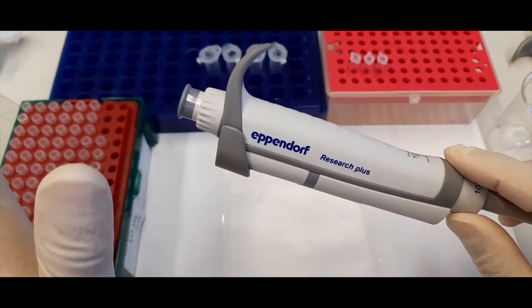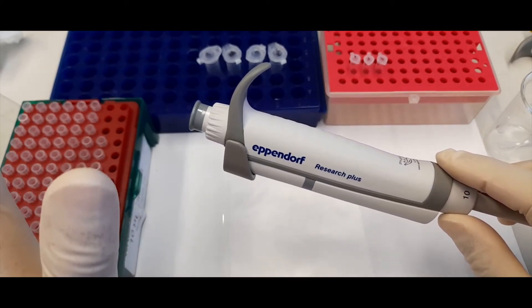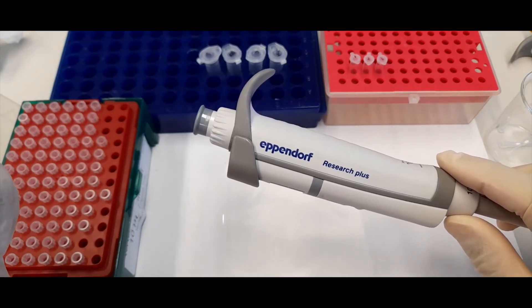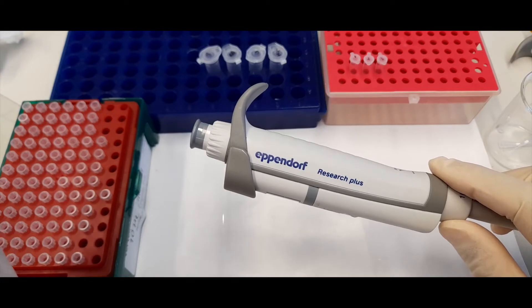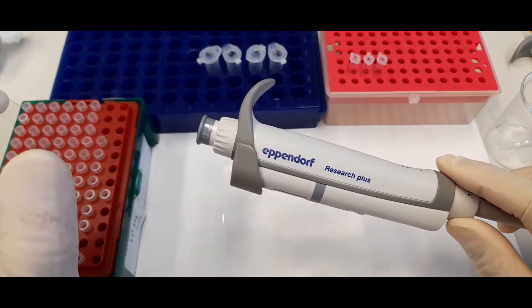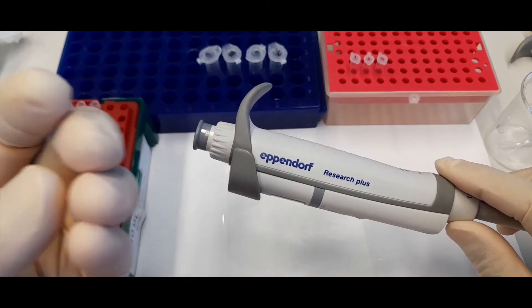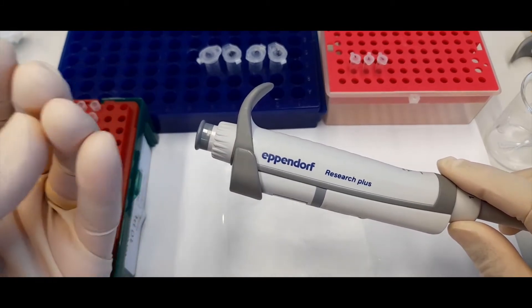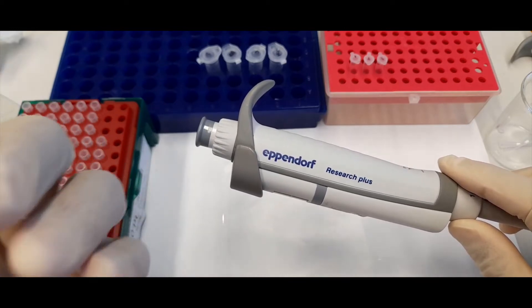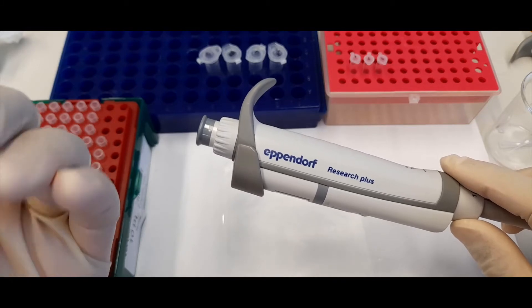So what do I mean by small volumes? By small volumes I mean anything less than 50 microliters. A drop of water is approximately 50 microliters, but in the types of work you'll be doing in the laboratory, quite often you'll be pipetting volumes much smaller than that — assembling reactions with a total volume much less than 50 microliters. These are things like PCR reactions or sequencing reactions where you're combining polymerase with sequencing primers and templates, and the volumes you'd be pipetting would typically be much less than 50 microliters.